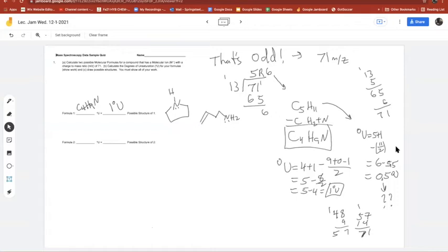Yeah, I can add an oxygen. So I could take my C4H9N and I could subtract how many carbons and hydrogens to add an oxygen? CH what? So Carson's asking, did I have to give 2 examples? It's whatever my instructions say. Draw possible structures. So I guess you could do 1 each, that's still structures.